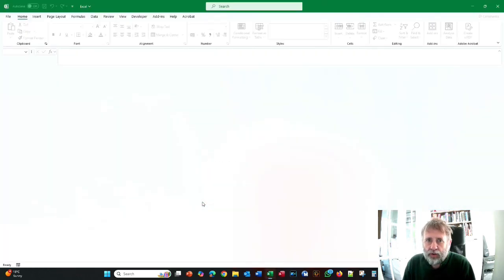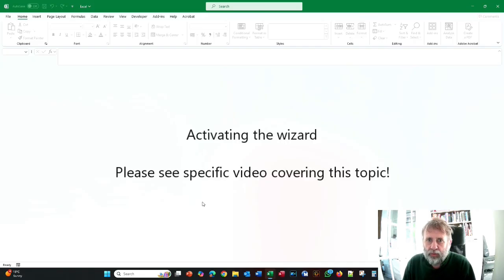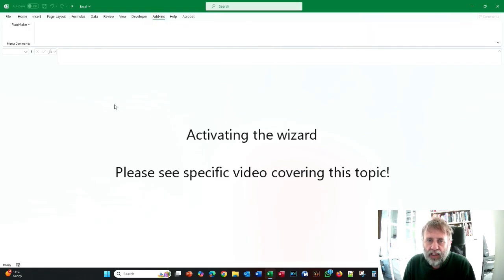And we've already done tutorial 1, or you should have already done tutorial 1. Now tutorial 1 can be done with an unactivated version of the software, but the other tutorials you need to purchase a license in order to do these.